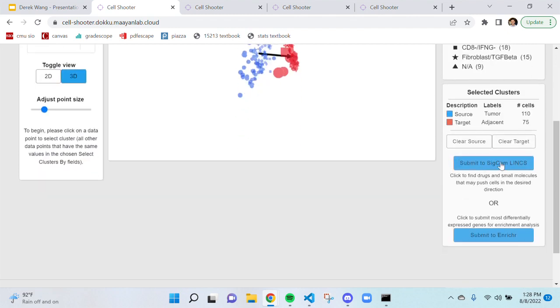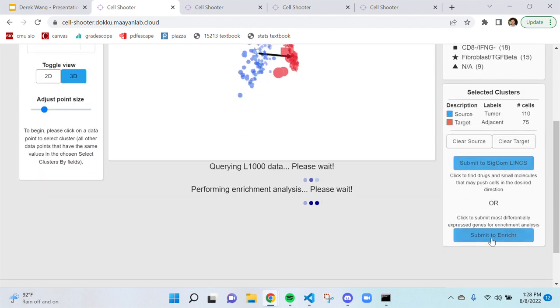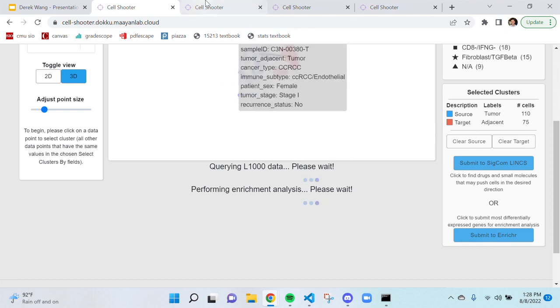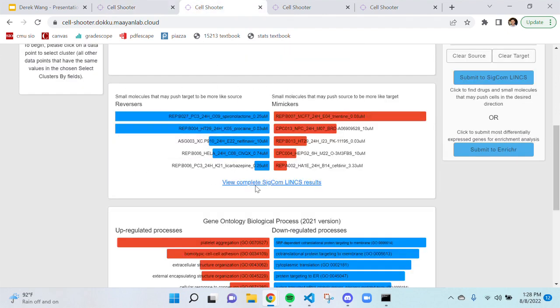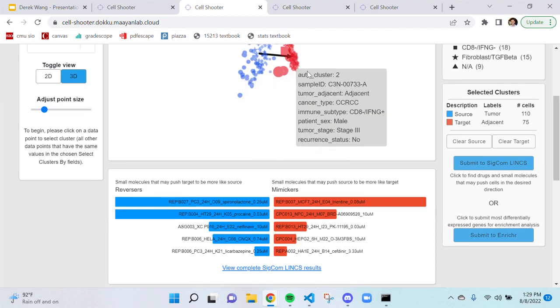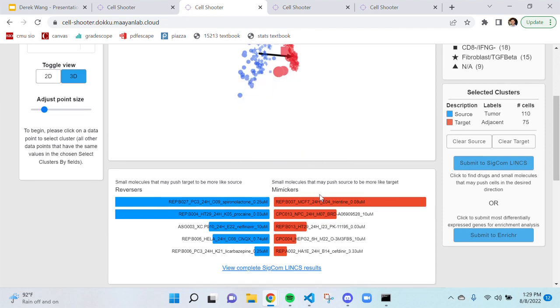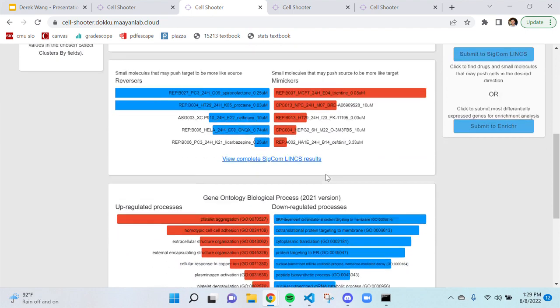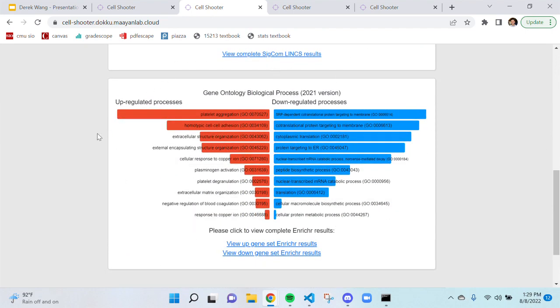We can then click on a couple of buttons to perform the differential gene expression analysis and submit the up and down gene sets to SigCom LINCS and Enrichr. Instead of waiting for it to compute, I can just show the results here. The results are a ranking of the top reversers and mimickers — the small molecules and drugs that may be used to push the cells from one expression state to another. Specifically, the mimickers may push the tumor cluster to be more like the adjacent tissue cluster, or in other words, mimic the computed gene signature. For the Enrichr results, the top up-regulated and down-regulated gene ontology biological processes are displayed.